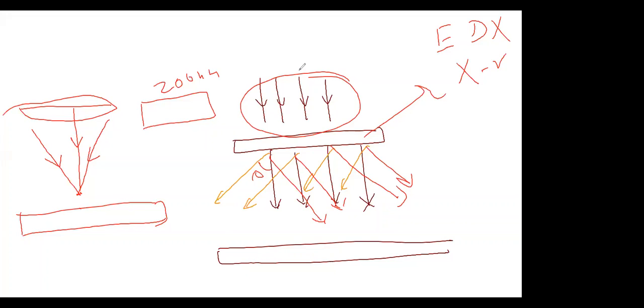So you have to move the beam here or here. Then you have to scan this area, this area, this area. So you start getting chemistry information selectively. This is called STEM, scanning transmission electron microscopy. Transmission means you are collecting the transmitted electrons. That's why you call it transmission electron microscopy, right? Scanning, because you're scanning the beam. In TEM you are not scanning the beam, you are just selecting an area.